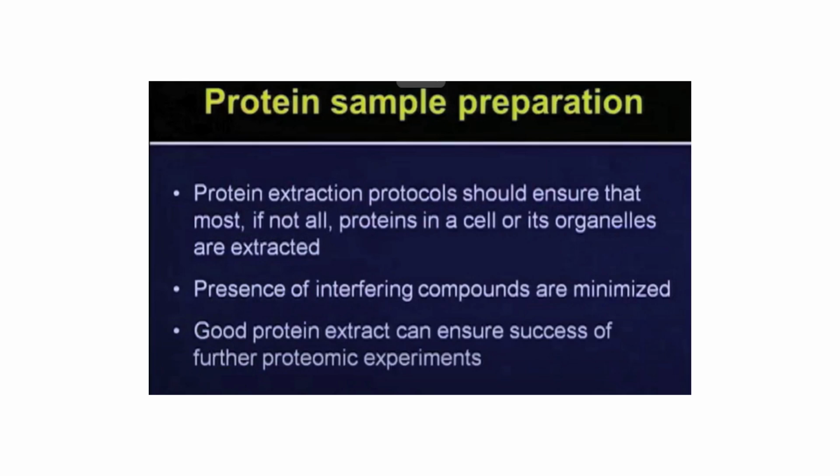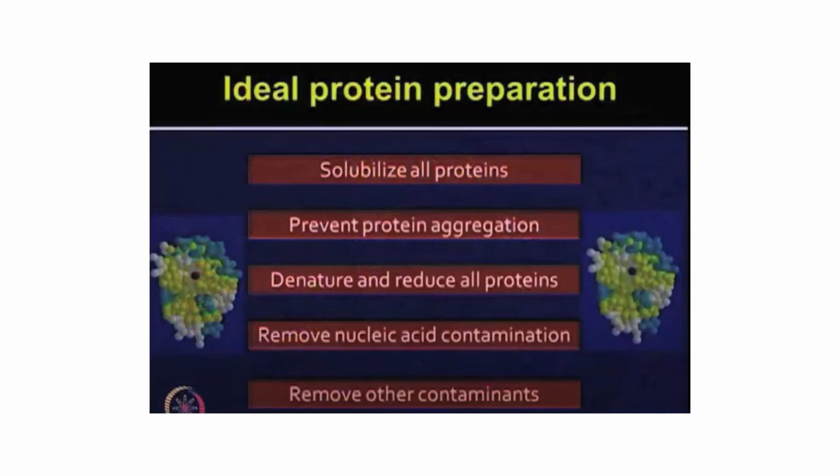The way you prepare it, only those particular proteins will be detected, and the way you are extracting the protein, only that specific protein will be detected. If you use certain chemicals for extracting, then only those specific proteins are visualized, or else they won't be visualized. So your sample preparation technique is the most important one in any kind of omics technique, be it genomics, proteomics, or metabolomics. Your sample preparation tells everything about your whole technique, what you will be seeing basically.